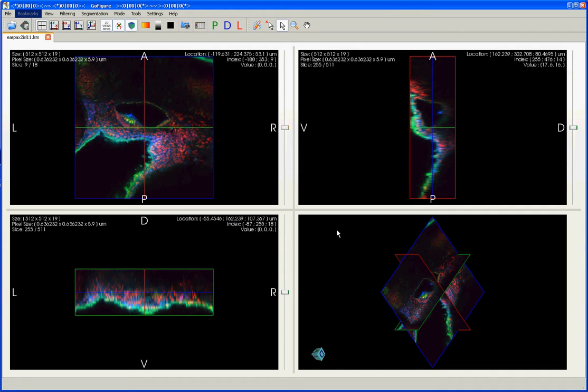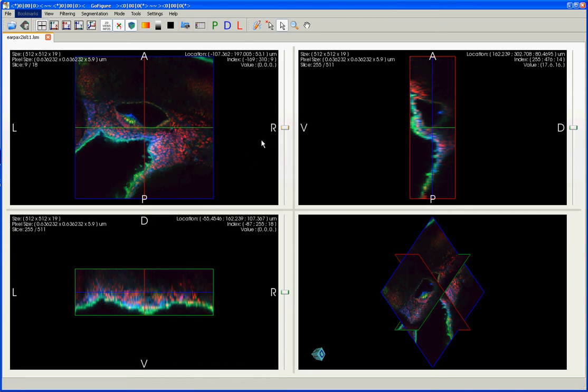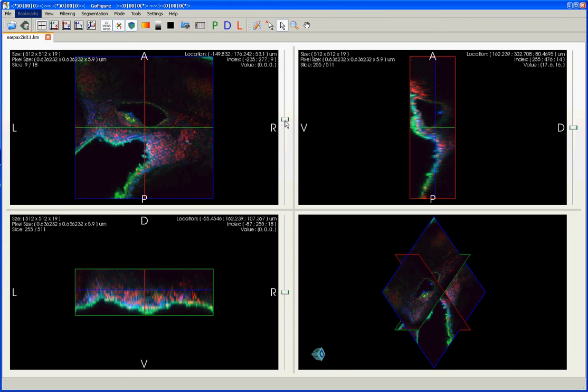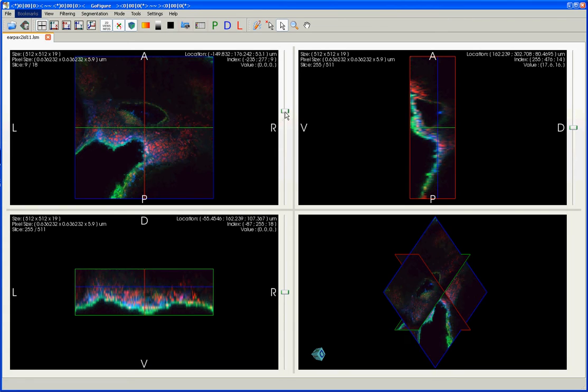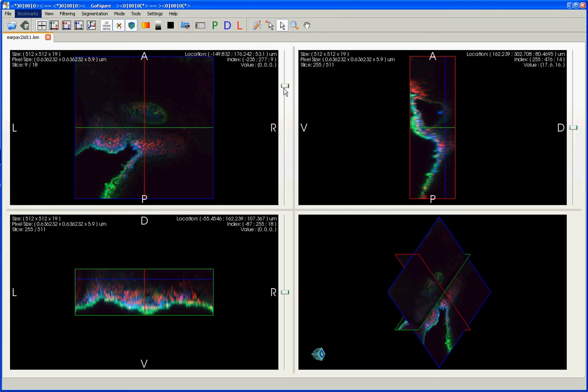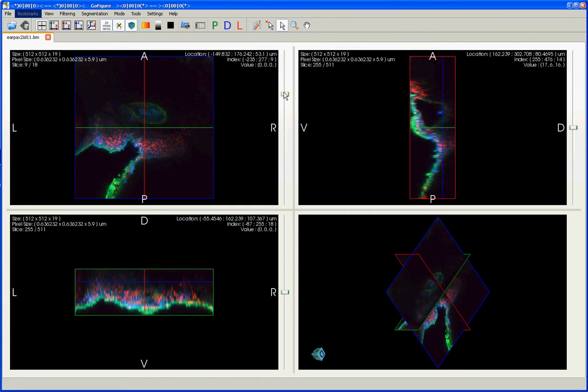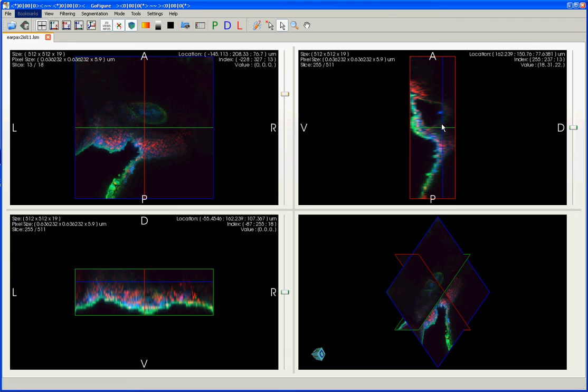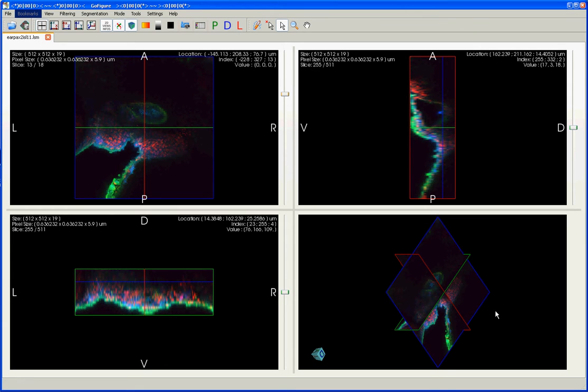You can use the sliders at the right of each of these views to navigate through any one of the dimensions in your image. So this slider to the right of the XY view will move you through the Z dimension. And you can see that reflected in this XY view, but also you can see that change occurring when this blue line moves in the YZ view or the ZX view. And you can also see the cross-section shifting in the 3D view.